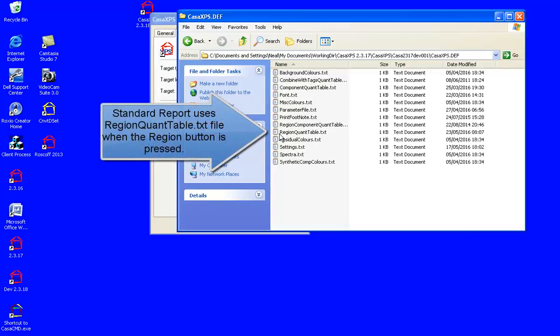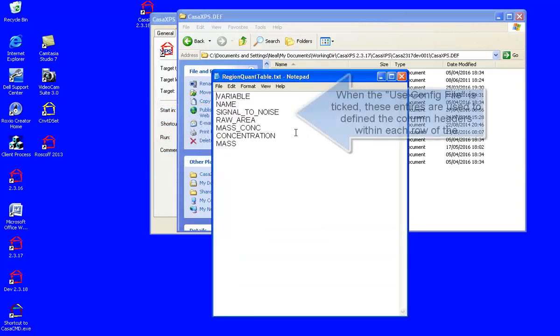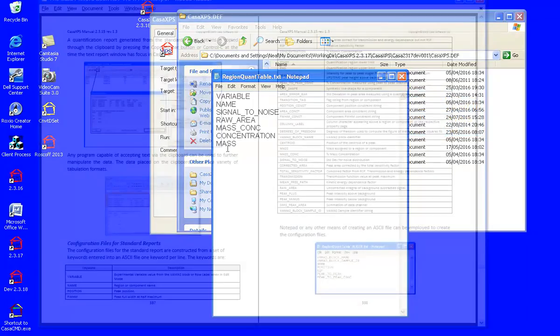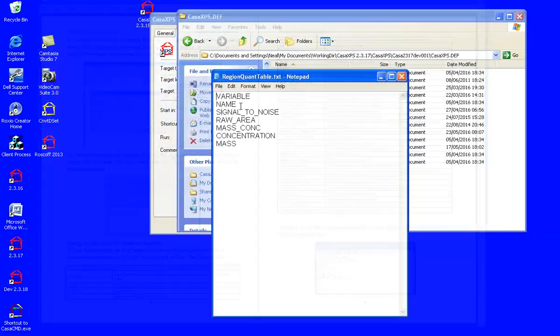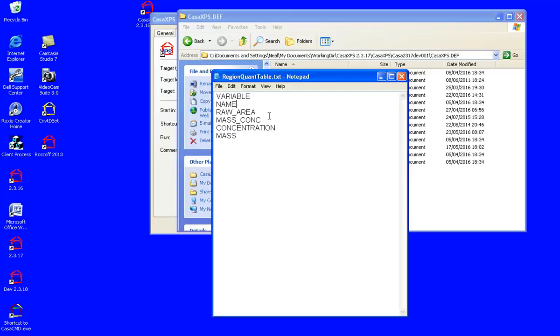One of these is the regions quant table, and within this you can see we have a set of keywords that define the type of report that we would like to see. We can modify this by changing these values.